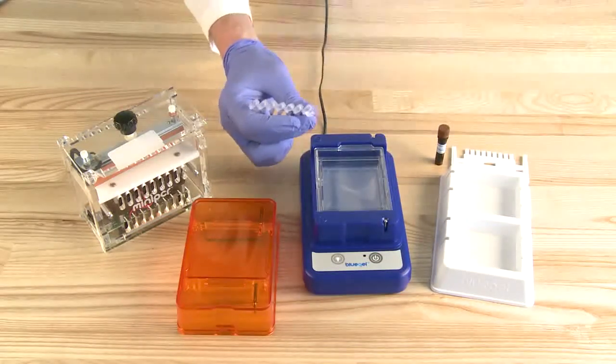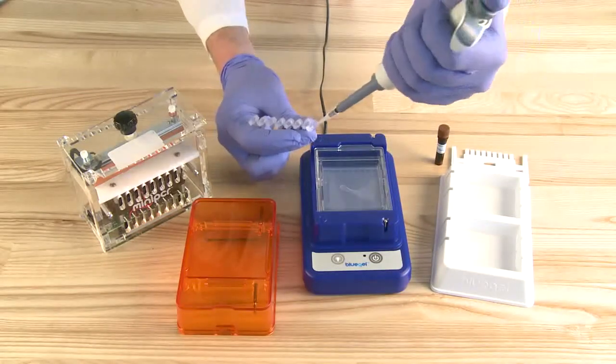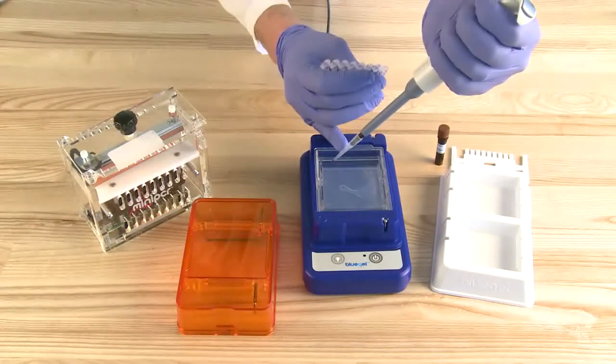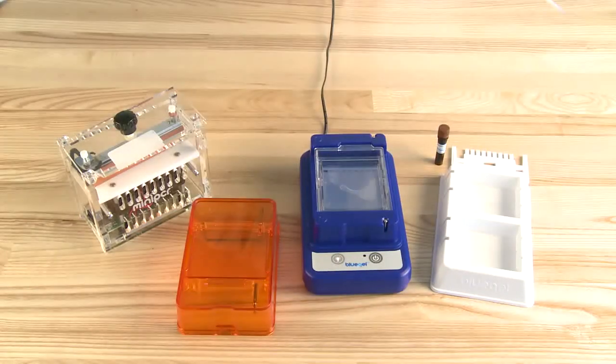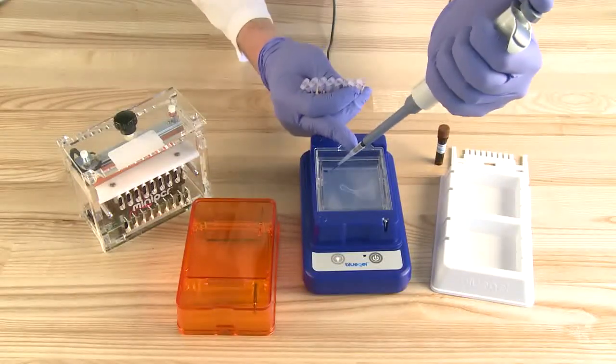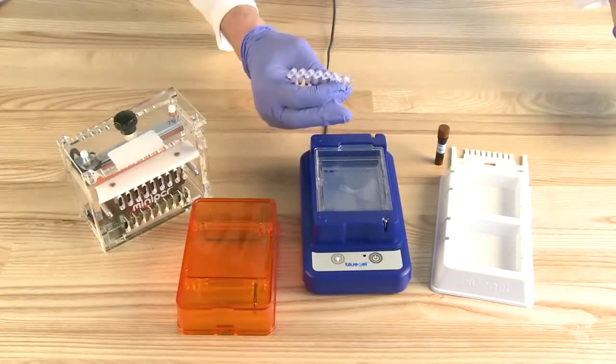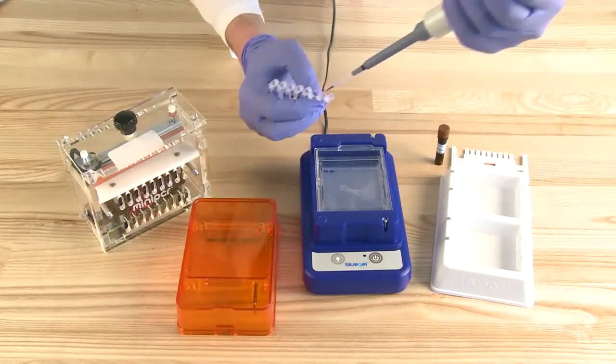Carefully pipette into the wells. Make sure not to puncture the gel. 20 microliters can be loaded into wells formed by 9 well combs and 10 microliters in wells formed by 13 well combs.